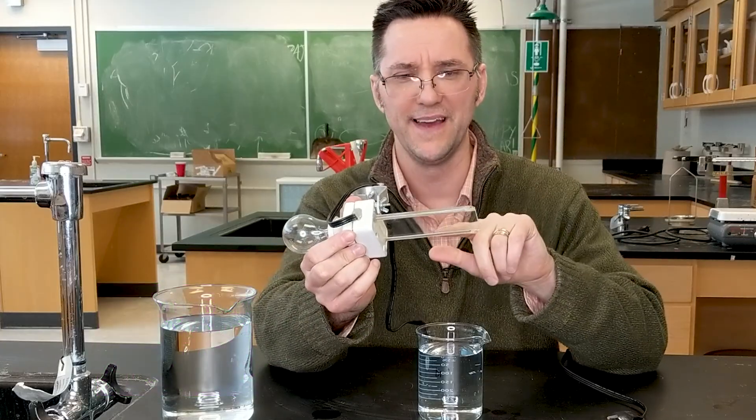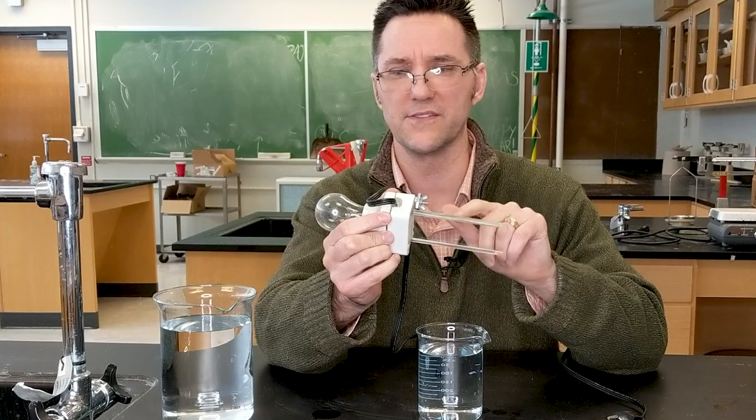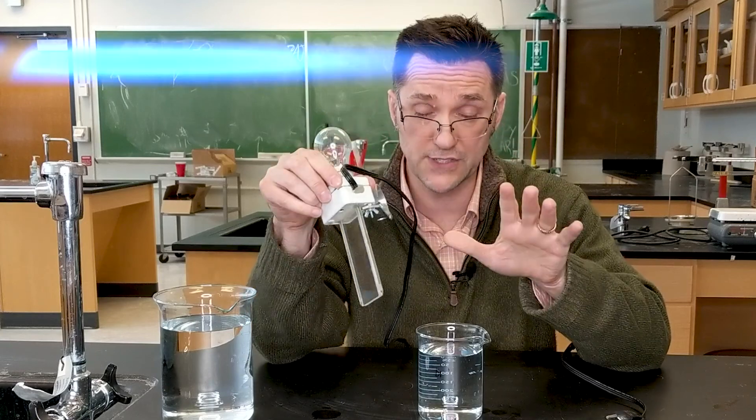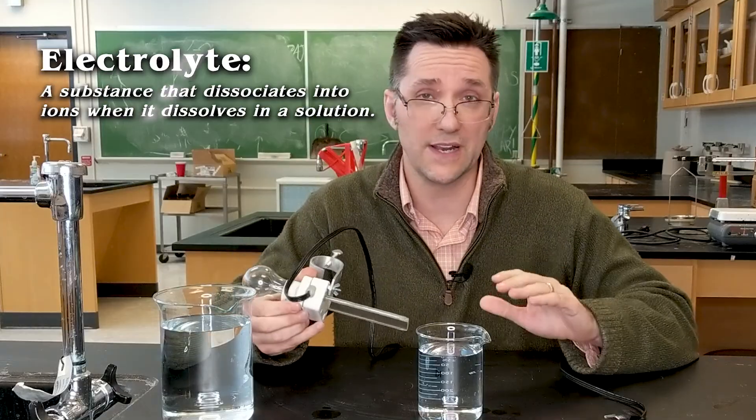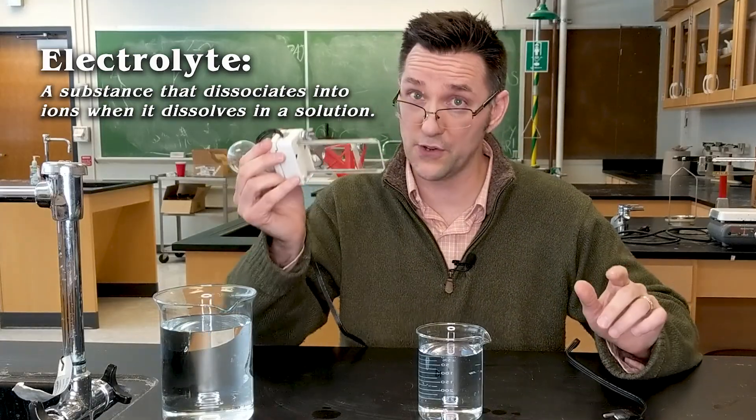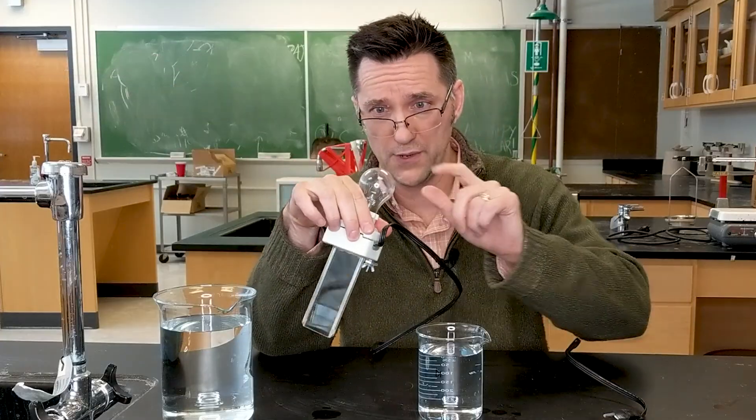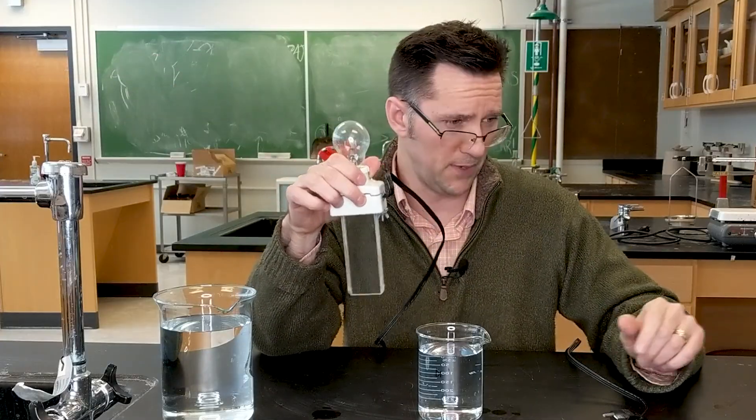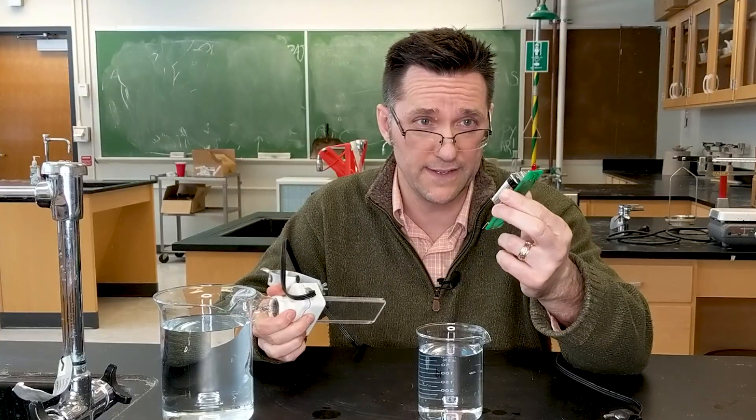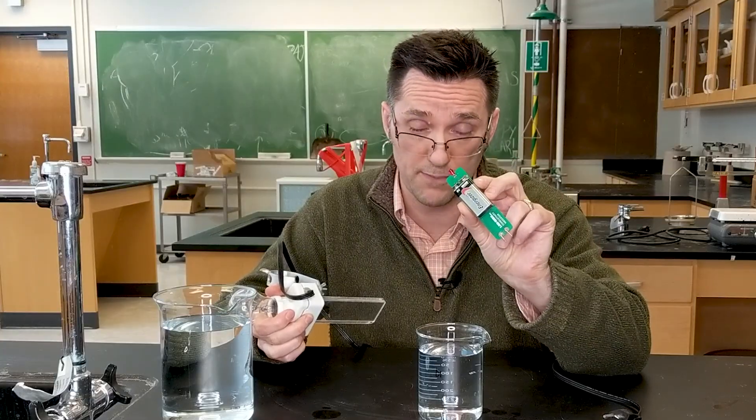But if it's wet, all bets are off. And so the electricity cannot complete the circuit, so the light bulb won't light. But if I put it in a solution that contains electrolytes, those electrolytes are going to allow the current to flow. So what I'm going to do is run through a series of solutions and show you with two conductivity testers. A big one, we'll need a little bit more to get this big light bulb to light, and then I have this little cute, adorable pocket conductivity tester using just an LED and a 9-volt battery.